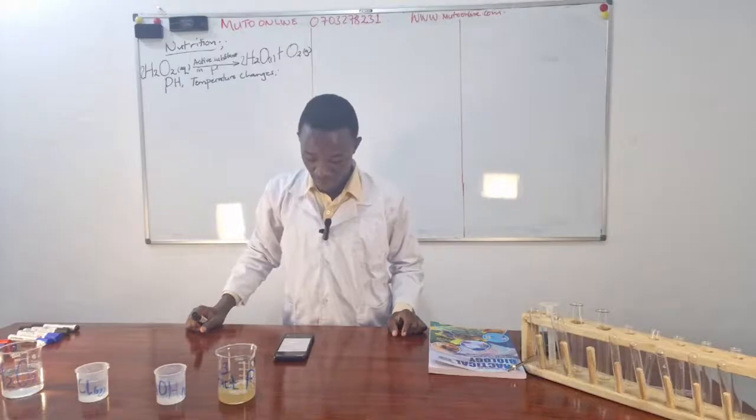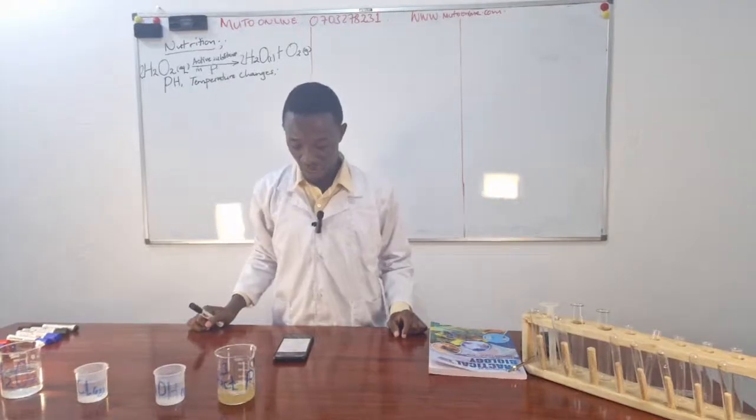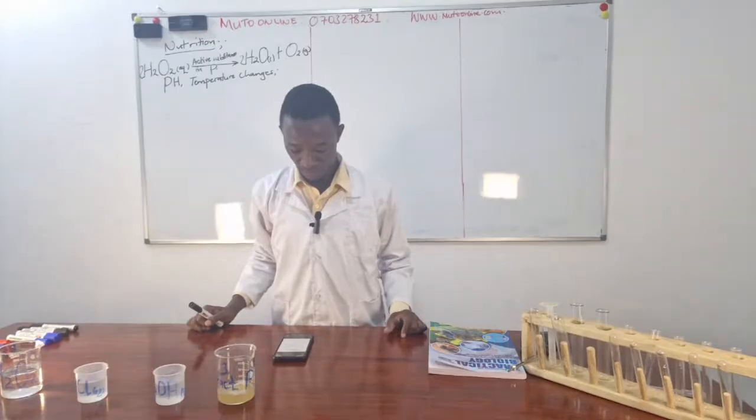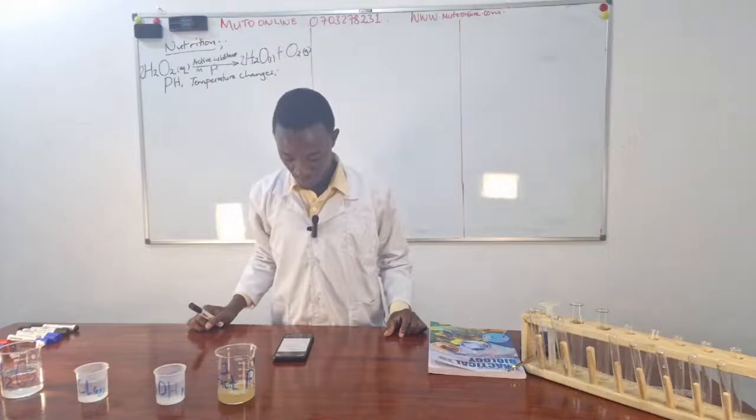As one of the employees, you have been appointed by the manager, having heard that you have some biology knowledge. You are provided with hydrogen peroxide solution, extract P, dilute hydrochloric acid, sodium hydroxide solution, and the laboratory equipment required.